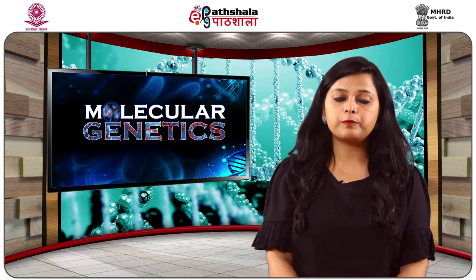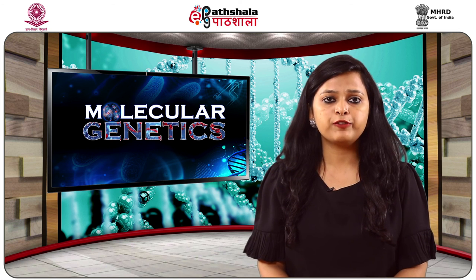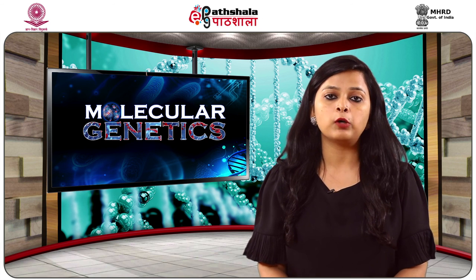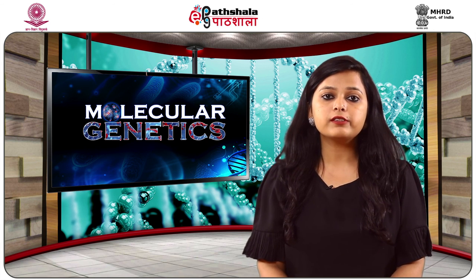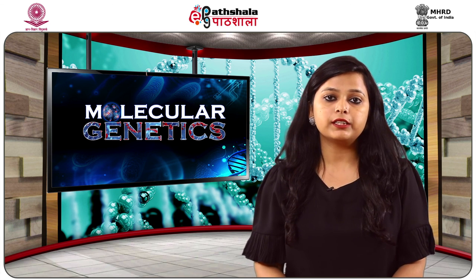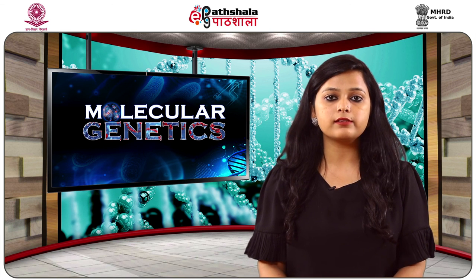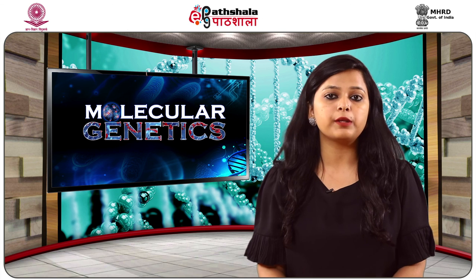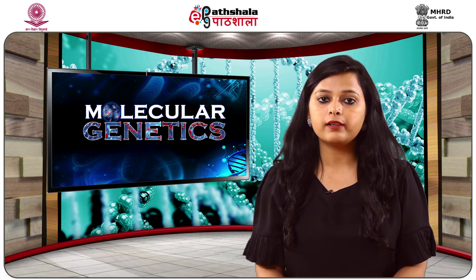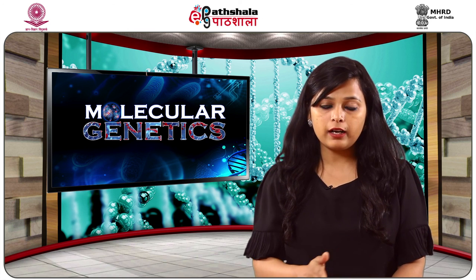To summarize this particular technique, we will just say in a few words that Southern blotting is one of the significant techniques in molecular biology. It was first developed by E.M. Southern in 1975. In this technique, the genomic DNA is digested with restriction endonucleases and the fragments produced are then separated by agarose gel electrophoresis on the basis of fragment length. After staining the gel, the separated bands are visualized.